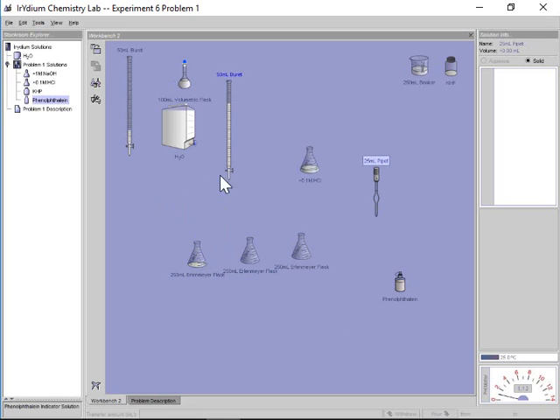I know roughly, because these concentrations are going to be about the same, I'm going to need to make sure I have at least 25 in here. And again, if that really is 25, I'm not going to have enough solution to actually do the next dilution. But if I'm careful for the first one, I can see what we end up with.